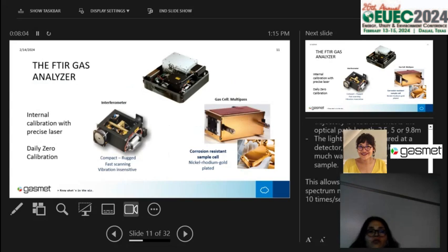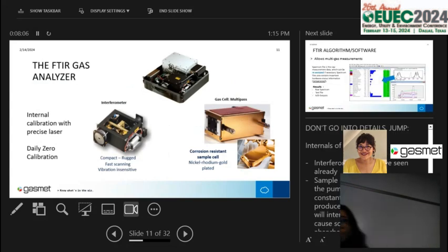So it gives a possibility for a future-proof design, really, because you could even deploy the instrument to measure emissions from a thermal runaway event in a lithium-ion battery fire, and you're going to be potentially working from the same base library with new components. So these are just the internals of an FTIR system like ours. There is an interferometer where all the light is produced and modulated and applied onto a sampling cell. Then there's a detector at the end, and then we measure how much light was absorbed in the process.